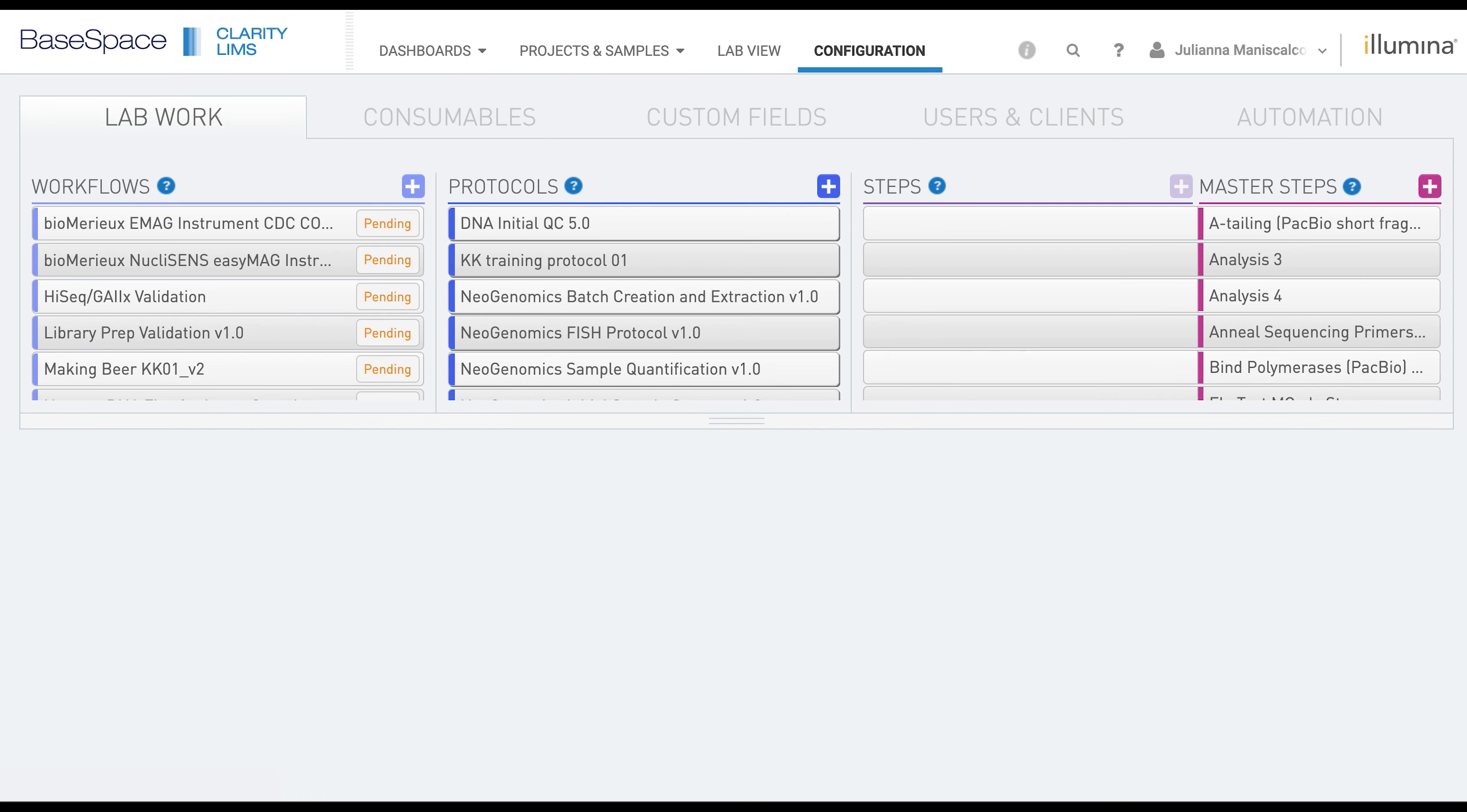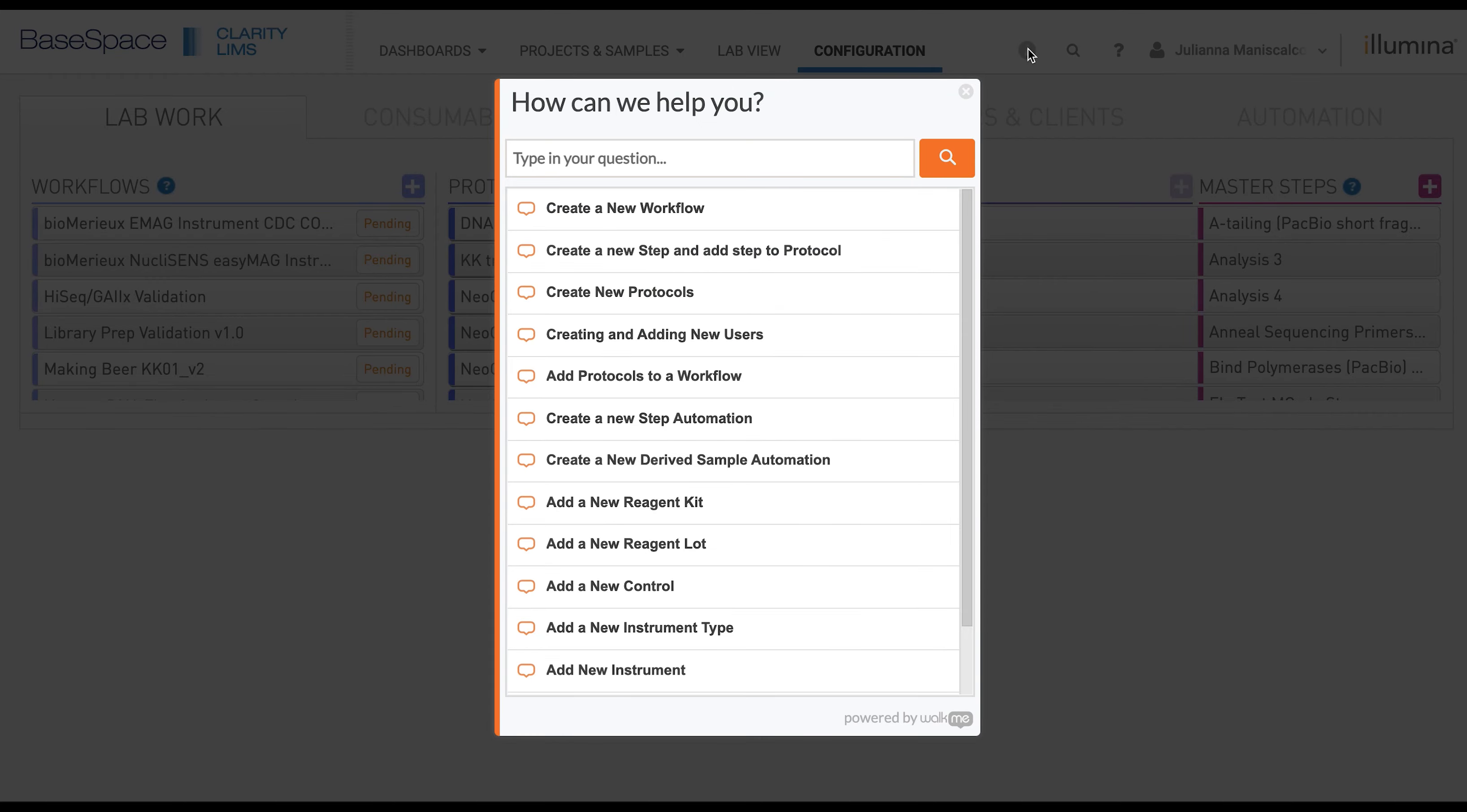If you click on the eye icon in the upper toolbar, you will find that there is a walkthrough of how to add a new instrument. In this video we're going to manually add the instrument to a step.